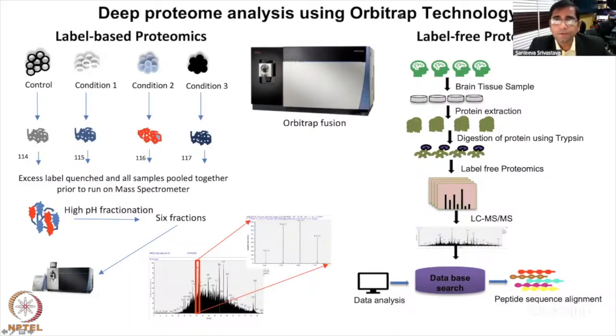And now TS are going to show the instrument, Orbitrap Fusion, which is one of the tribrid instruments. We primarily use it for a lot of deep proteomic analysis and quantitative analysis. So Amit and Ankit, please discuss the Orbitrap Fusion now. Yes, sir. Thank you, sir.